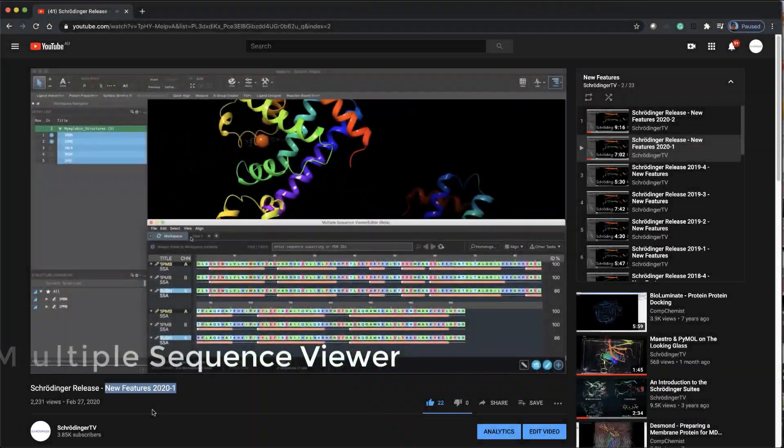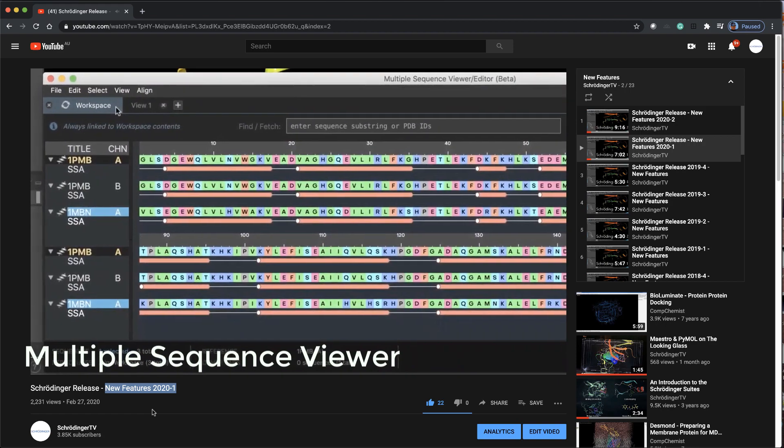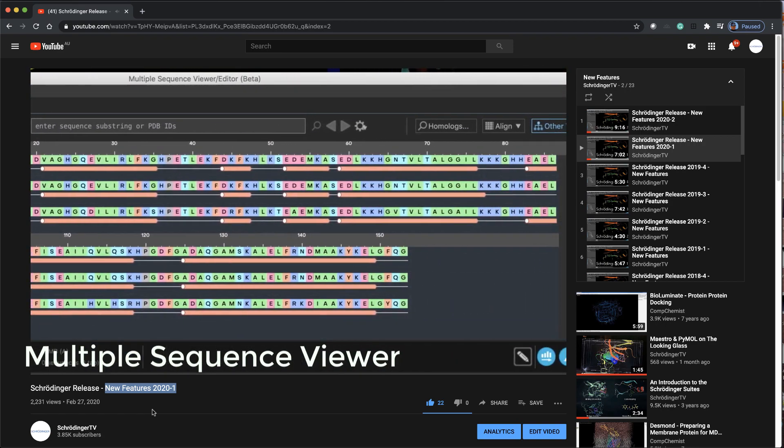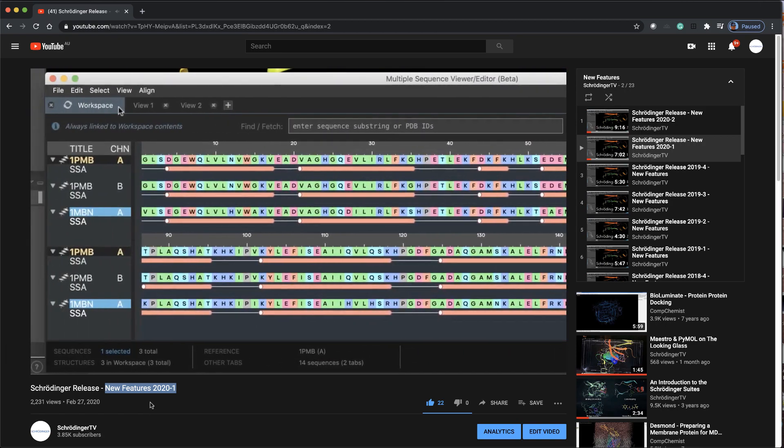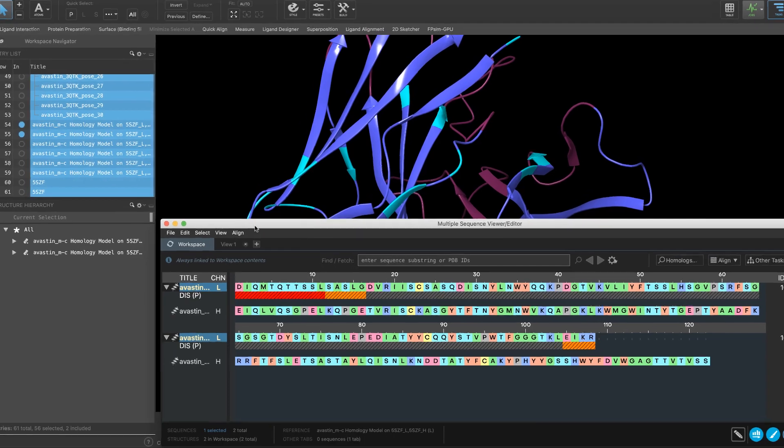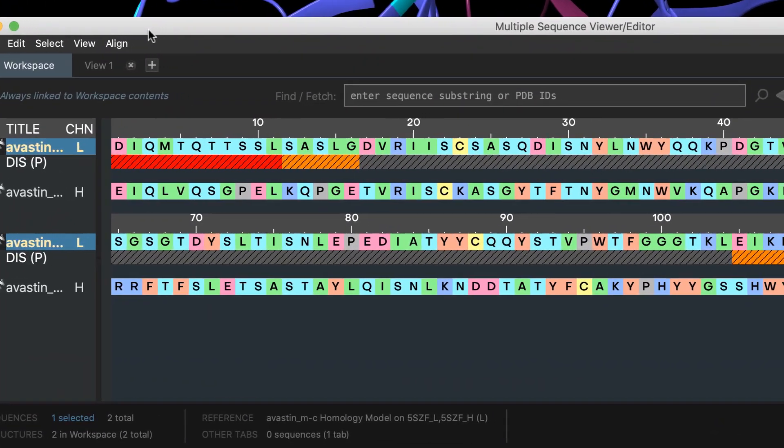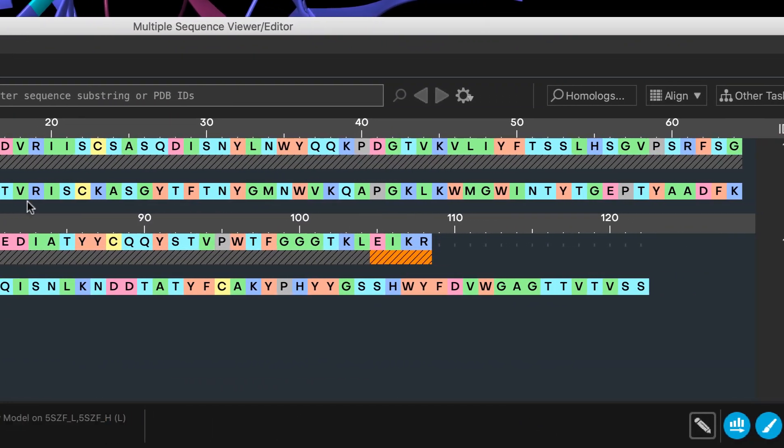Back in 20-1, we saw the beta release of the multiple sequence viewer. Click the link above to watch the highlights from that previous video. Now for 20-3, we see the official release of the multiple sequence viewer.